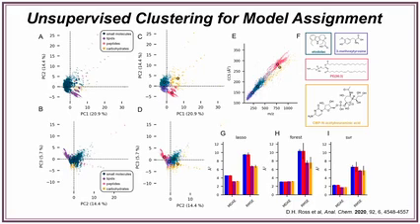And so you can see in this example of what they've shown, the coloring for these different clusters is based on the identity of the molecule. So there's lipids, small molecules, carbohydrates, I think is the other one, and peptides. And you can see that they fall in very different places of a mass to charge versus CCS plot. And they also are in different places within this clustering. So there are models developed specifically for predicting CCS values for lipids, a different model for metabolites, small molecules, and so on. So if you're really uncertain about what you have, this might be a resource to try.